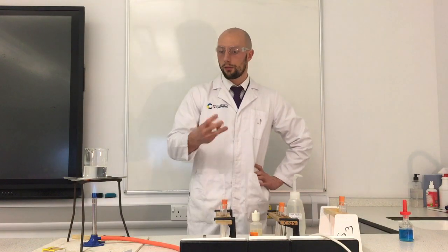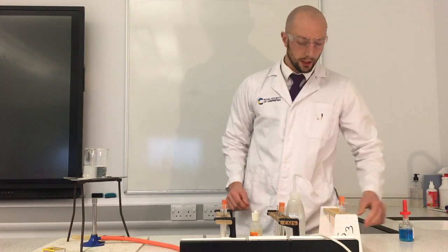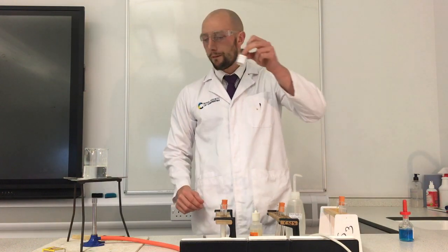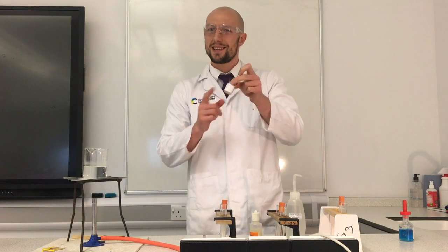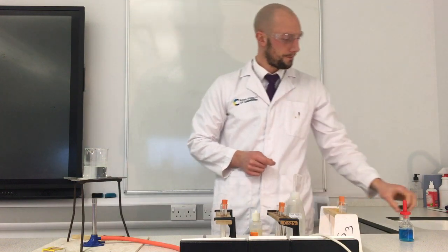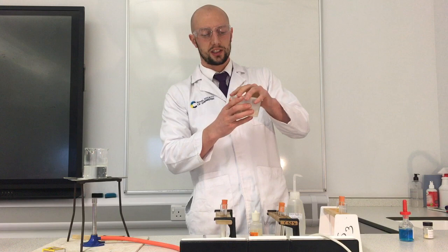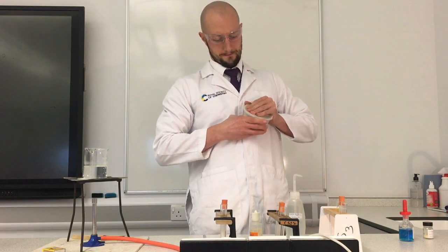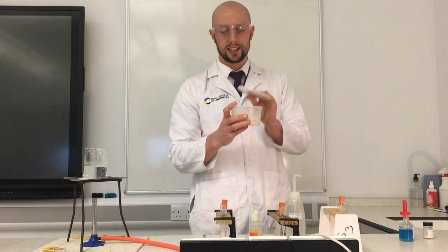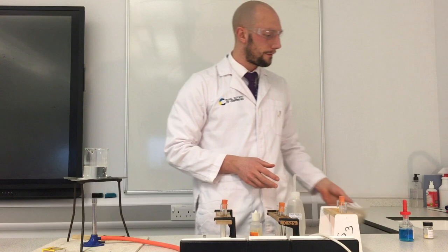So I've done 3 different food tests on 3 different foods. I started off with my energy drink powder, like Lucozade. And what I found with that energy drink powder is that it contains glucose, but it doesn't contain fat or starch. Then I've got my rice cakes. I'll show you inside the box. There we go, rice cake. We found that the rice cake contains starch, but it doesn't contain glucose and it doesn't contain fat.